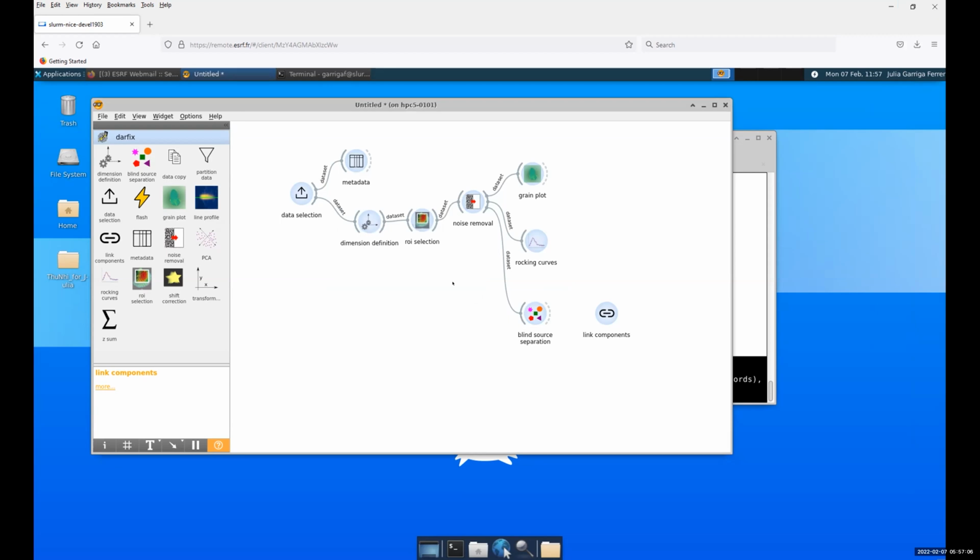We are interested in the usage of the method. So can you make some recommendation regarding the number of grains, the size of the grains that can be really probed by this method? 5 microns and up. We can do a bit smaller, but it becomes really, really complicated. 5 microns a minimum grain size, I would say. Yeah. I mean, you can do a bit smaller than 5 microns, but 5 microns and up is good. Okay.